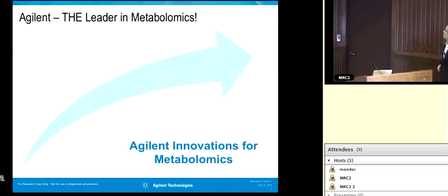With one of our collaborators, Justin Cross from Memorial Sloan Kettering, was very kind to provide us with some data that we could use and present upon. I'll touch on how the software workflow actually was able to tease out this metabolism in the cancer cell line.